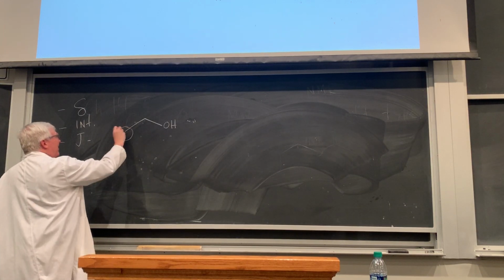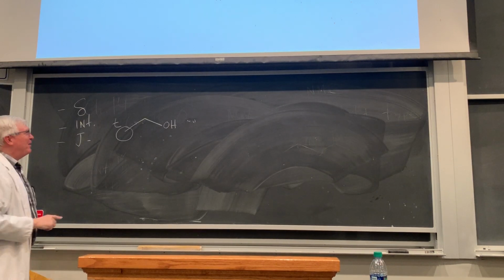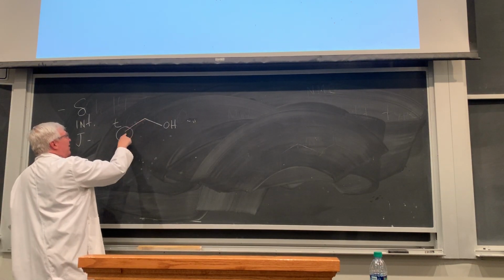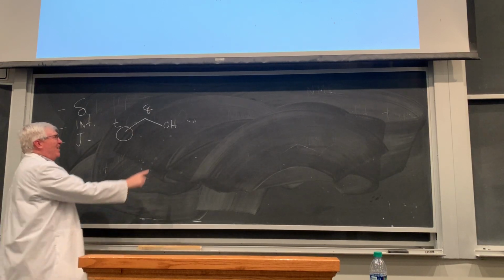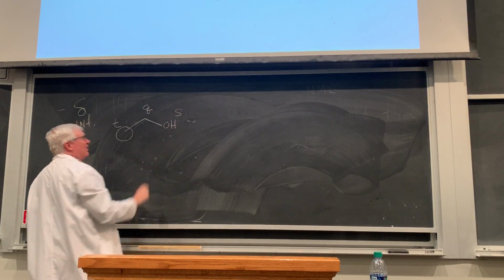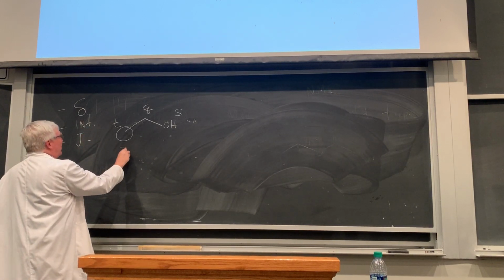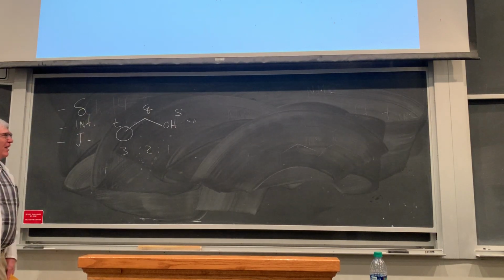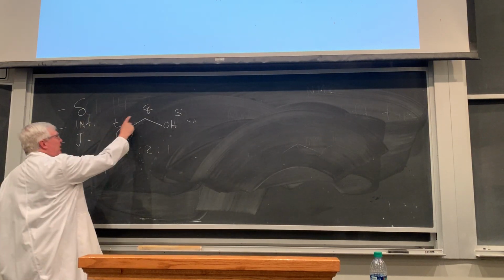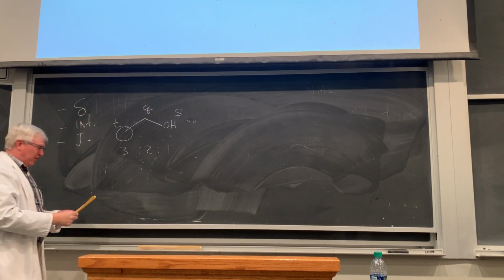This methyl group here has what? 2 neighbors, so it shows up as a triplet. These are little multiplicities. This methylene has 3 neighbors, so it shows up as what? A quartet. Okay. This one stays as a singlet because it's hydrogen bonded. So there's your multiplicities here. What about the integration? 3 to 2 to 1. Okay. Let's see how we get these triplet, quartet, and we didn't have doublet, but we're going to get to that here in a second.